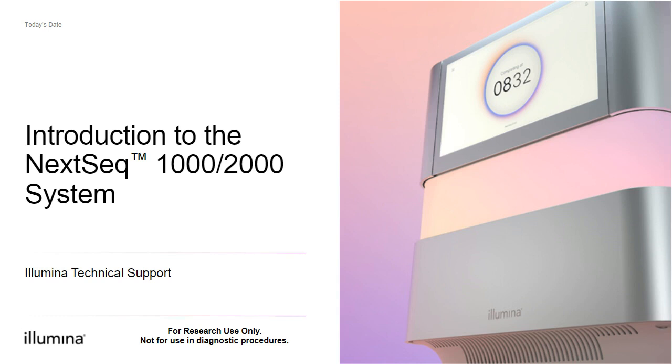I do want to note before I get in that I will be referring to the system as the NextSeq 2000 throughout the presentation for simplicity. Let's dive in.